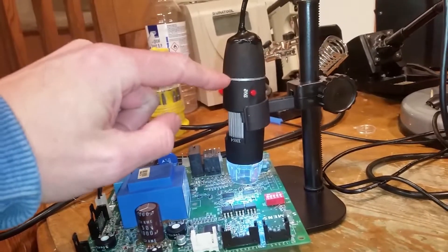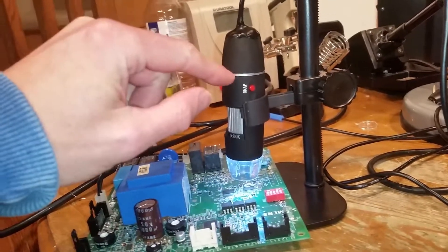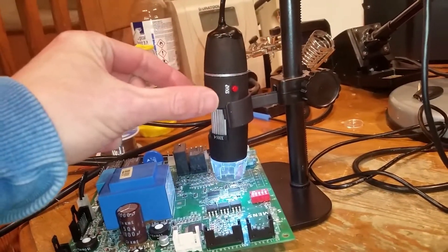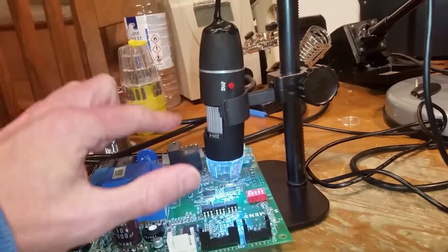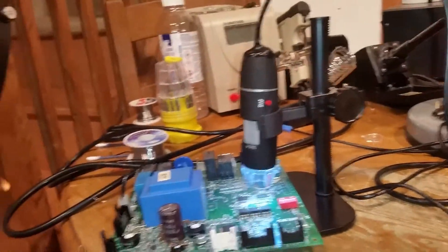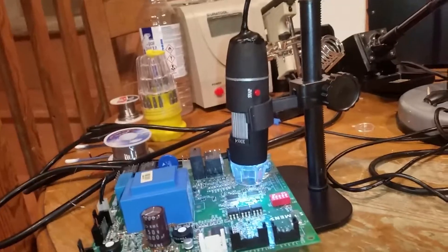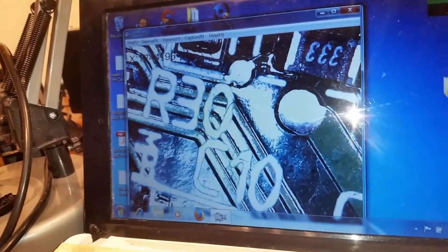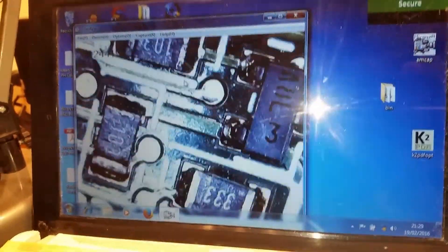How I approached it was wrong. If you're going to fix it, what you should do: take this little silver collar off - it's a plastic ring - that'll expose little holes and teeth going around here. Break one and then take this section off. I broke it in the wrong place, which is bad because there's metal conductive poles going down and the board is actually sitting up here using them. So half my fix-it video was patching up what I've done wrong - I've had to make it good with hot glue and plastic dip, but you know that's the quality you can expect from a 13 quid USB microscope.